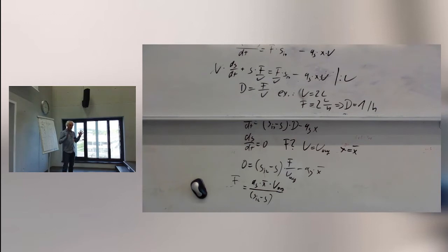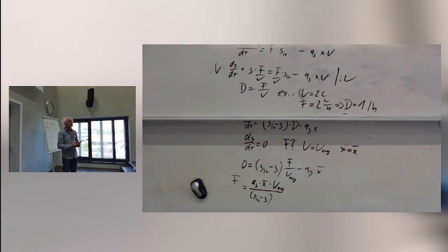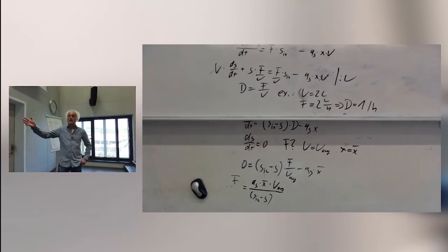Yeah, so that was why we did that. If we want to calculate exponential trajectories and so on, this makes no sense. This is just for the system where we have a constant flow rate over the complete period, and we want to optimize for that. And we want to have a starting value. Yeah? And this is what you do again in your fed batch experiment.